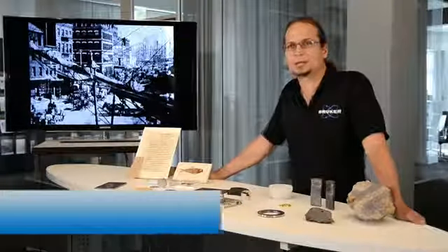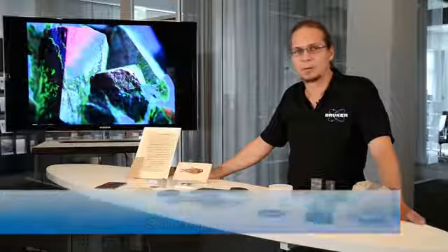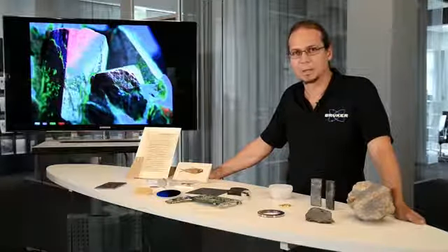Welcome to Bruker Nano. My name is Roald Tagle and I am the application scientist responsible for micro-XRF here in our facility. Today I would like to show you a brief introduction of what is micro-XRF and what type of samples we can measure with micro-XRF.